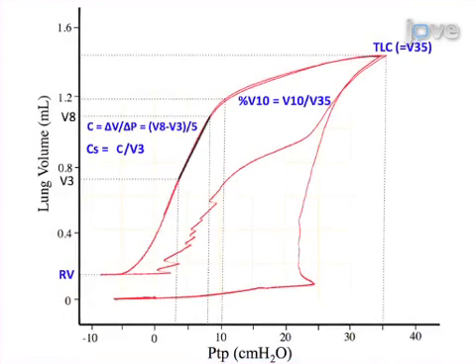Ultimately, assessment of the pressure-volume curve allows the evaluation of multiple variables that can reflect the structural changes that occur in lung disease. The main advantage of this method, which has never been standardized in a mouse model, is that the lung distensibility reflects the pathologic changes in lung structure associated with different lung diseases, especially emphysema and fibrosis. This method is easy to perform, and it can help answer key questions related to the changes associated with lung disease.